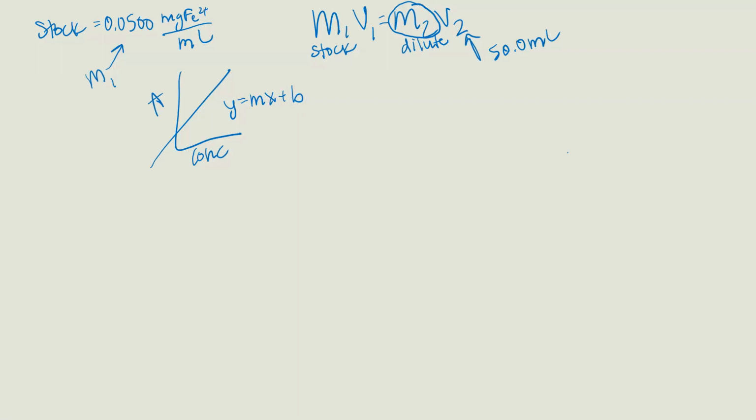And then in the data table, it says slope of Excel graph unrounded, line, space, line. So the slope of the Excel graph number is coming from whatever value is there in the M spot. And for a lot of people, this number is somewhere around 200. It's different for everybody because every instrument's a little bit different. But it should be a largish number, like 200, 100, 300, something like that. It shouldn't be a very, very tiny number. So that's where you're going to get the number part.